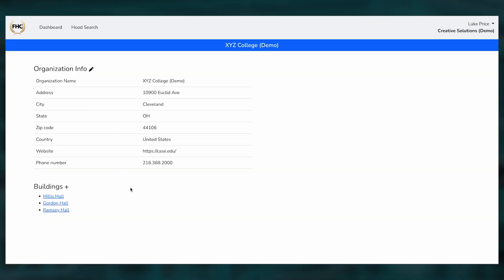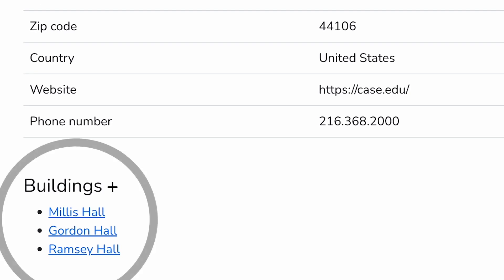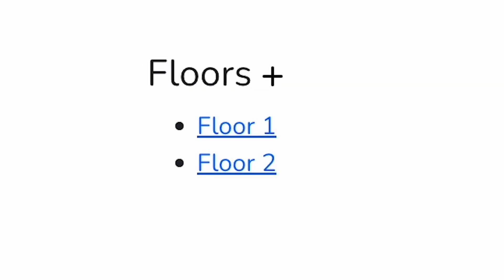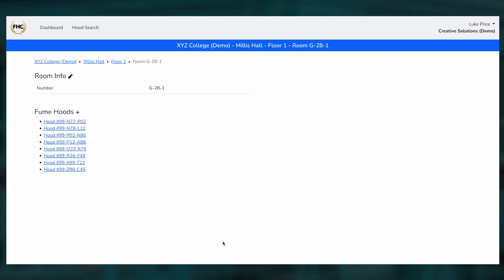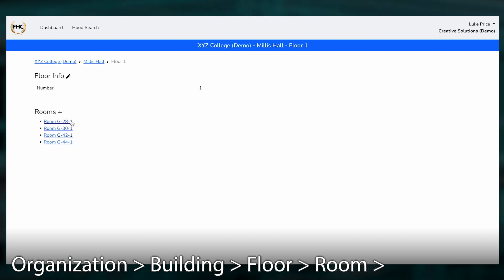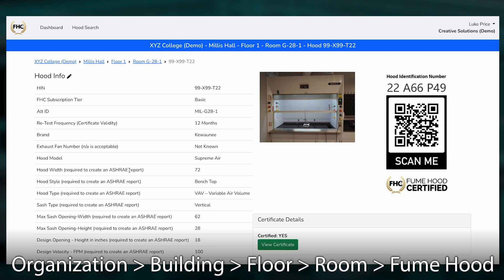Inside an organization's profile, you'll find all kinds of important information about it, as well as the different buildings that you have logged and associated with this organization. Inside any certain building is a list of floors, inside any certain floor number is a list of rooms, and inside the rooms is the database of any fume hoods that have been tested by you. This is a game changer because you can now specifically assign a searchable location to every single fume hood that you test for that client.